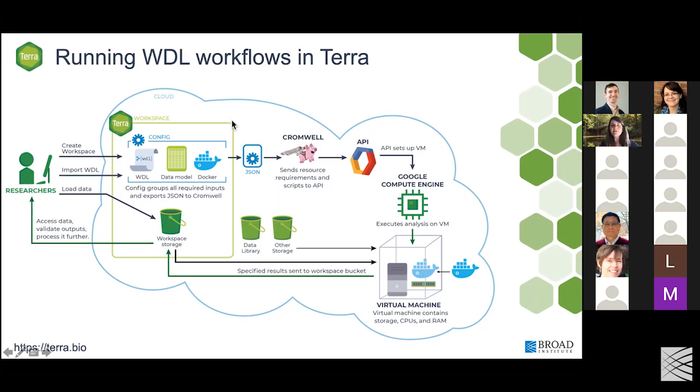So this is just kind of giving you a sense of what's happening when you hit that run analysis button in Terra. You don't have control over setting up this Google computer. This is not something you need to do. It's all happening on the back end for you. And I say this because today you're also going to get experience creating your own virtual computer in the cloud using the cloud environments. That's not the same thing as what's happening when you launch a workflow. You don't create this VM in the cloud for your workflows. This is all being done for you. Okay.